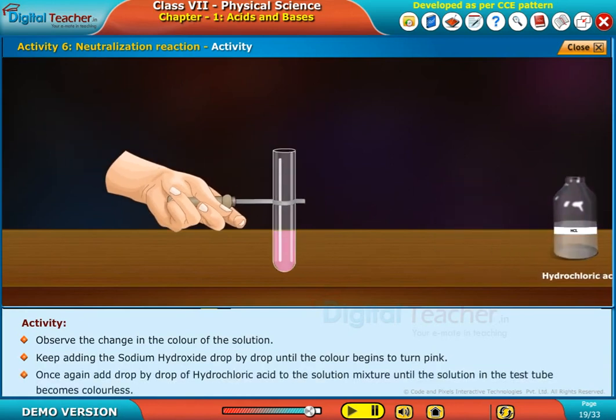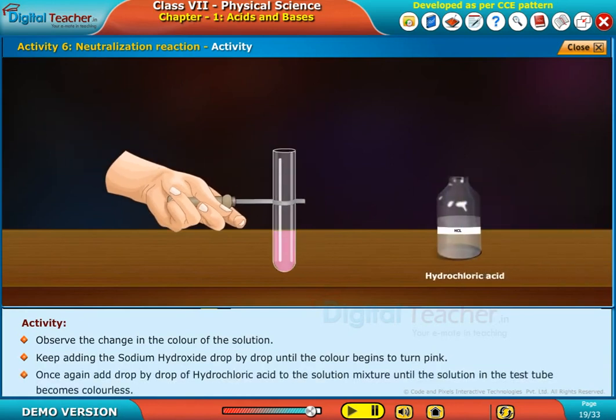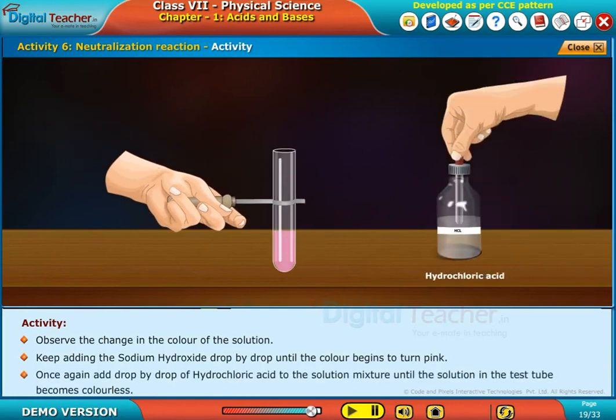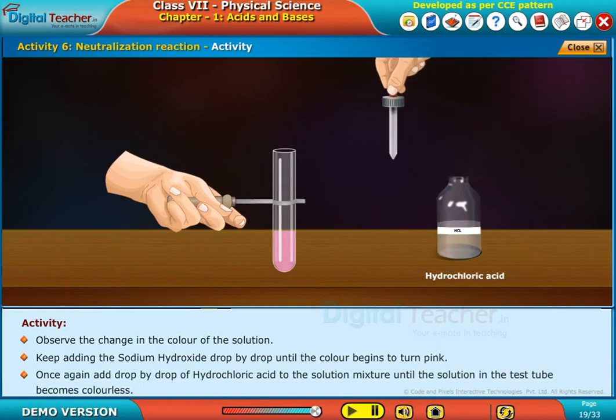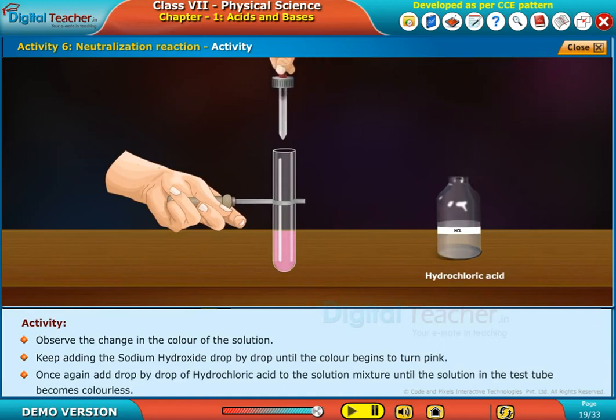Once again, add drop by drop of hydrochloric acid to the solution mixture until the solution in the test tube becomes colorless.